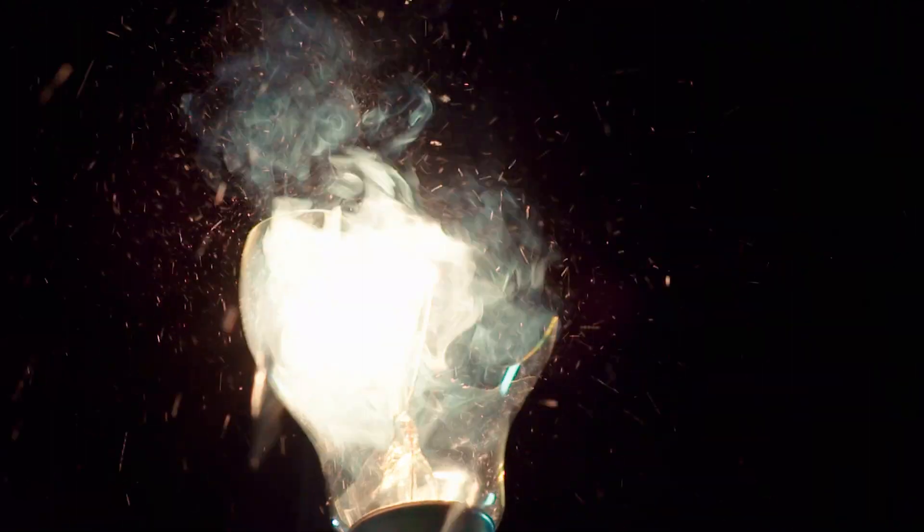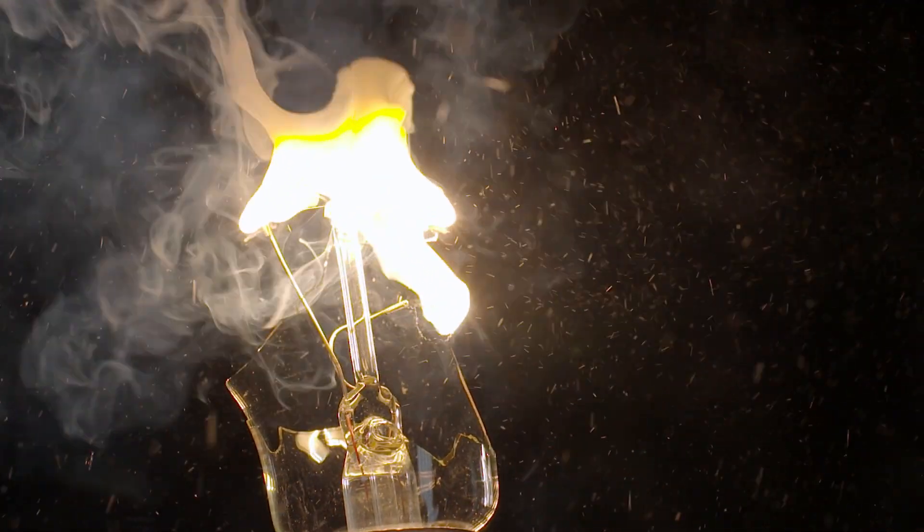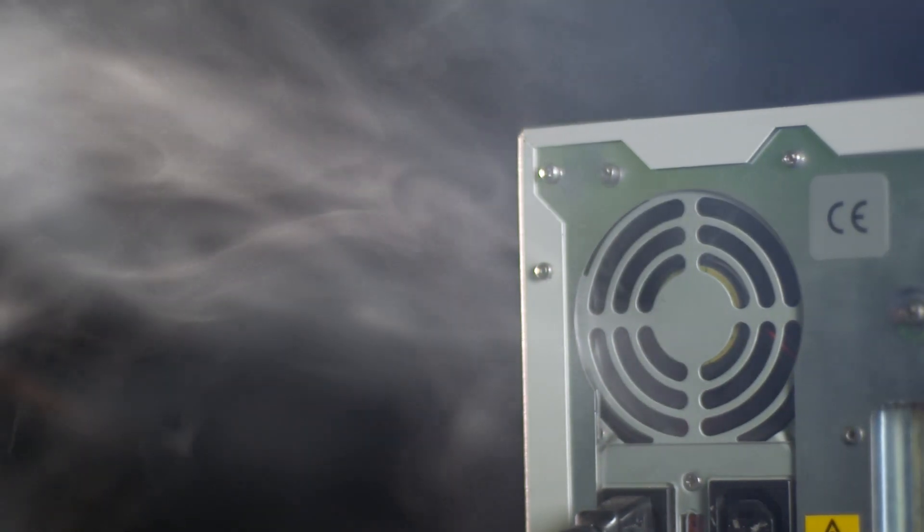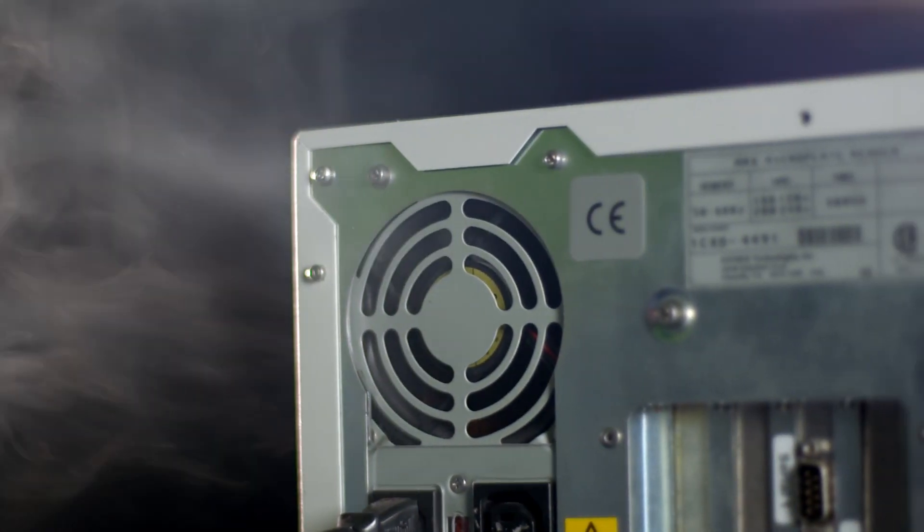Unlike traditional readers using filament bulbs, which generate significant heat requiring the use of cooling fans and vents which draw unwanted dust onto the optics and reduce light transmission.